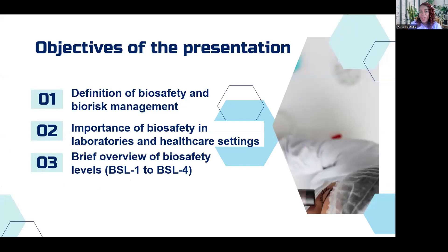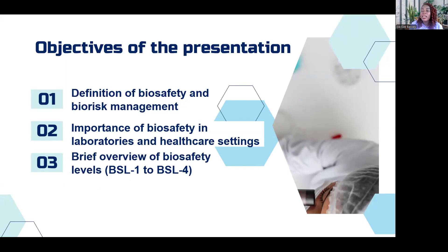So what would I expect you to know at the end of this presentation or module? I would expect you to be able to define biosafety and bio-risk management — I've done that in a lot of my other videos, please check them out. We need you to know the importance of biosafety in laboratories and healthcare settings, and to have a brief overview of the biosafety levels.